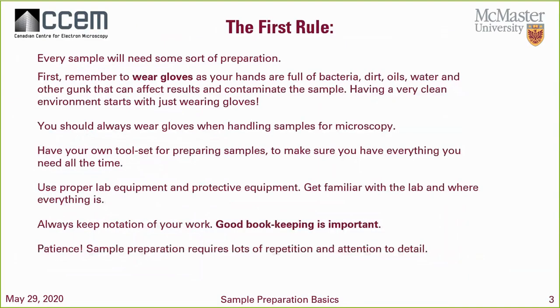So to start off, I just want to make sure that everybody understands that there's a rule. Samples need some sort of preparation, even if it's something as basic as putting tape on an aluminum stub just to mount it on the holder for the SEM, or just cutting the sample, which is also preparation. And our first rule that I want to make sure everyone knows is we have to wear gloves, okay?